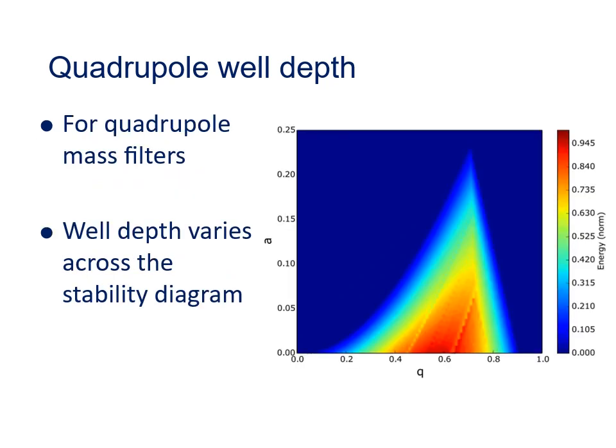One measure of the strength of gravity on Earth, that is the depth of our gravitational well, is to keep throwing objects in the air at faster and faster speeds until you find the speed beyond which nothing comes back down again. This is known as the escape velocity. And we can use the same approach to find the trapping well depth in quadrupoles.